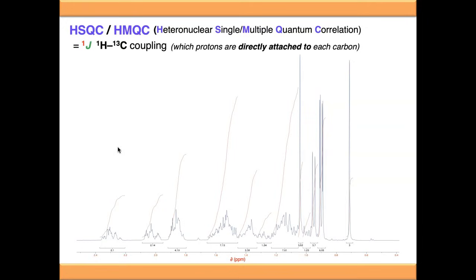The other thing that I use HSQC for quite a lot, and it's kind of an off-label use if you like, is when you've got a proton NMR spectrum that looks fairly horrendous. So in this case, this looks a bit like a kind of forest of peaks. I mean, there's a few signals that you can kind of pick out, but all of this stuff over here is a mess of kind of overlaid signals.